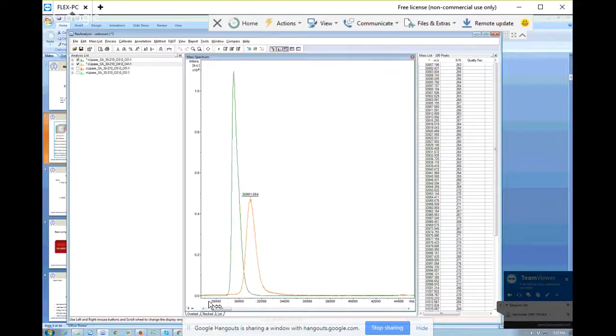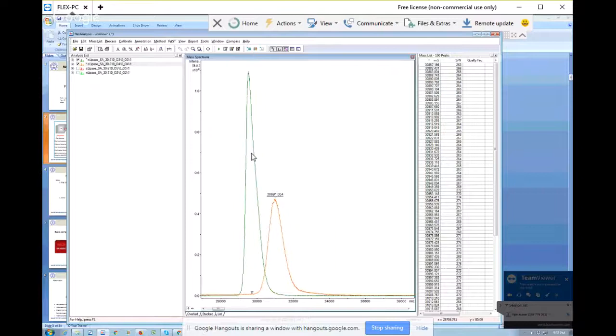So this is just one way in which we can use MALDI to find and to represent how the changes occur in a particular molecule. If there are some dyes that are attached to a protein, or whether there is some mutation that is happening, these studies can be taken up very well in MALDI.